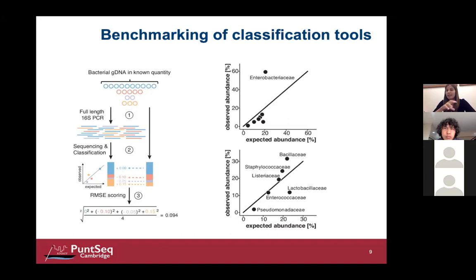And I'm already doing this here on the bacterial family level, because all of the other analysis that I'm going to show you now, he also performed on the bacterial family level first, because going further down to the bacterial genus and species level always requires some additional confirmation steps, which I will also show you later. But for now, we are staying on the family level. However, it was straightforward here because each of the 7 species I just told you about belonged to a different family. So the mock community is based on the fact that all the species are very remotely related.